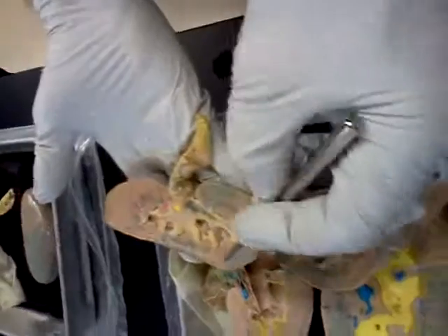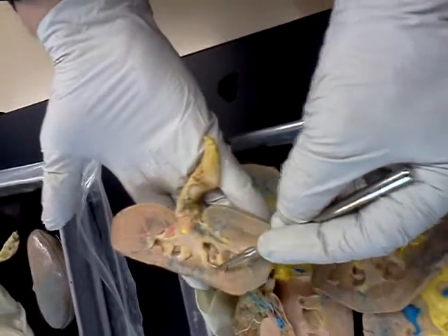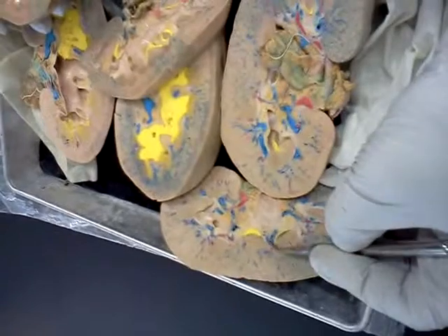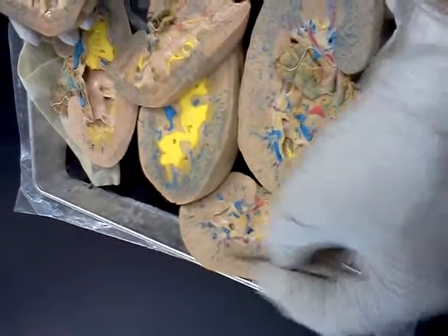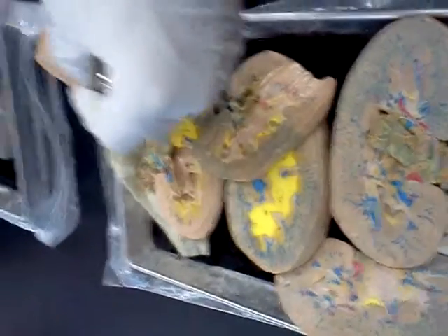Okay, so now you notice when you get into the medullary tissue, it just looks kind of brown, and that's normal. Then you see these columns that come in between, and you see some in this big one too. These are the renal columns, and they come in between. Oftentimes there is vasculature that goes in there as well. Here's a renal column, renal column. These are renal columns in between here.